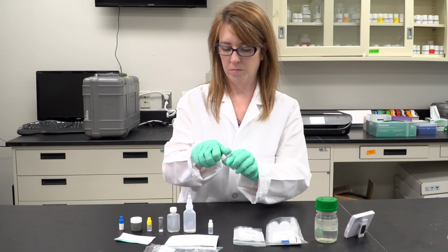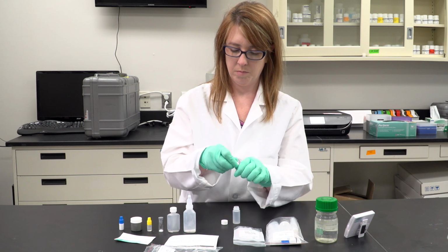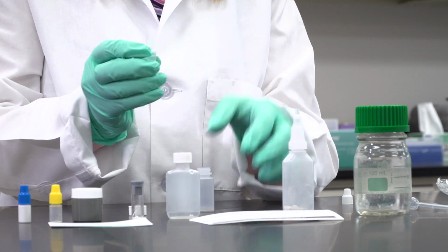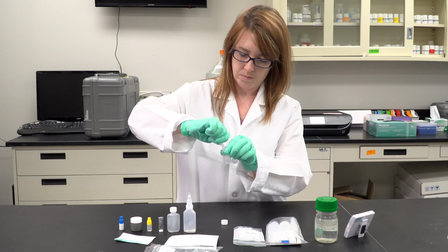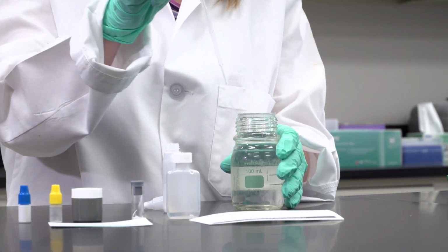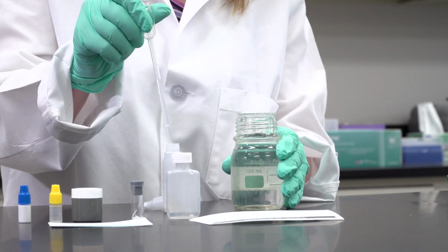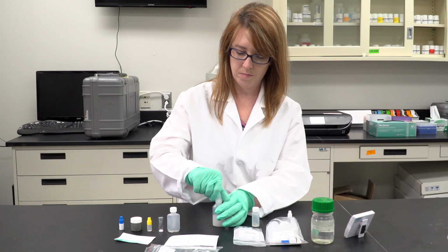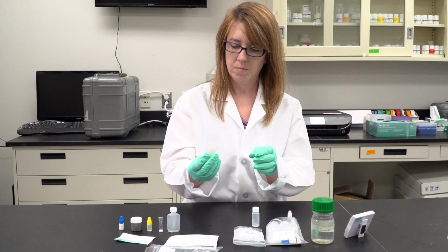To begin using the Quickcheck SRB kit, simply rehydrate the chemical lysing reagent. The lysing reagent bottle has a very tiny ring on the bottle. It is not empty. Collect the sample. Turn the bottle upside down and shake to suspend all filtration medium. Keep inverted for 15 seconds.